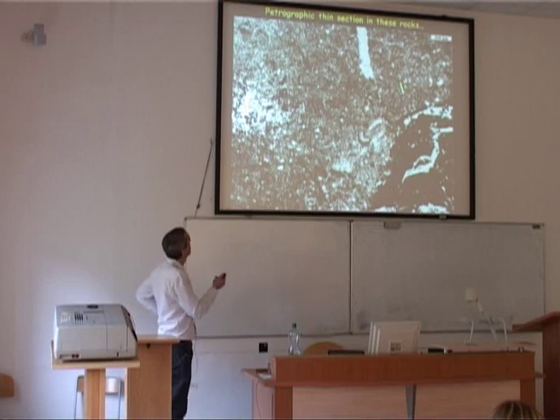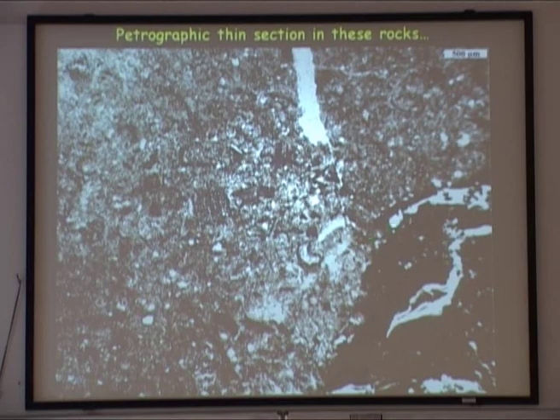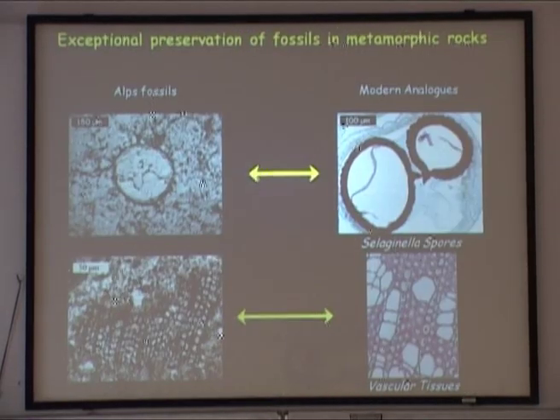If you look at a thin section of these rocks by light microscopy, this is what you can see. So you have a carbonate matrix, all the white areas, and you have many dark objects. Those are fossils. This is how they look. You have this kind of object, dark round-shaped spheres, and this kind of object.